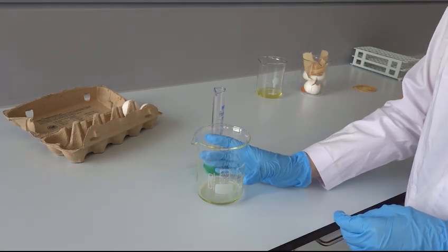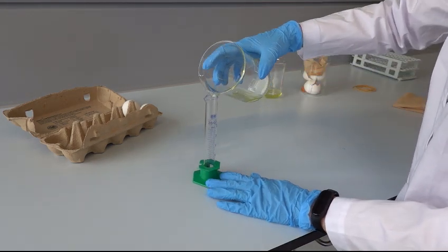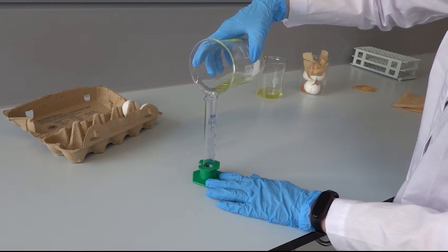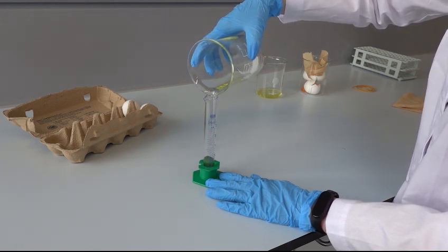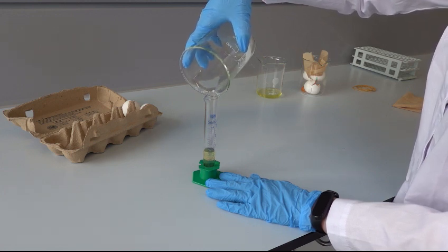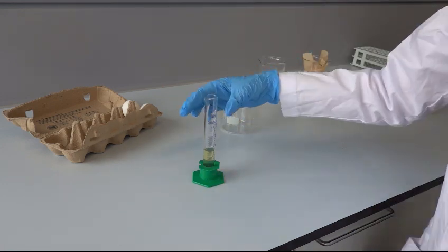In the next step, transfer the filtered egg white into a cylinder and note the total amount of egg white. If the filtered egg white will not be used the same day, close the cylinder with aluminum foil and store it in the fridge until the beginning of the next course. Otherwise, place it on ice.